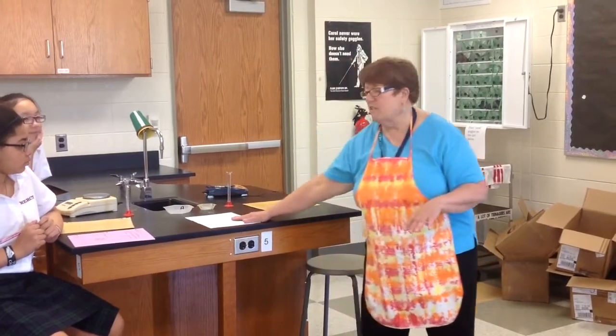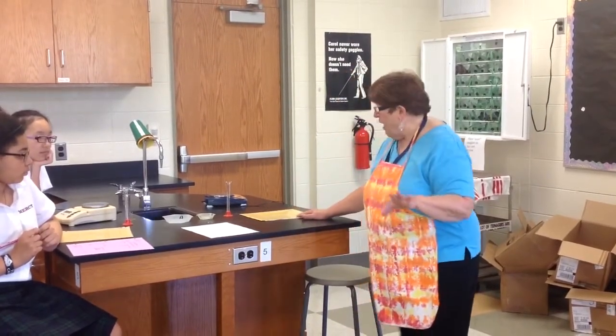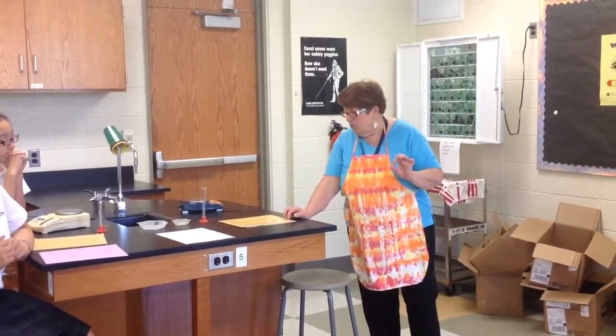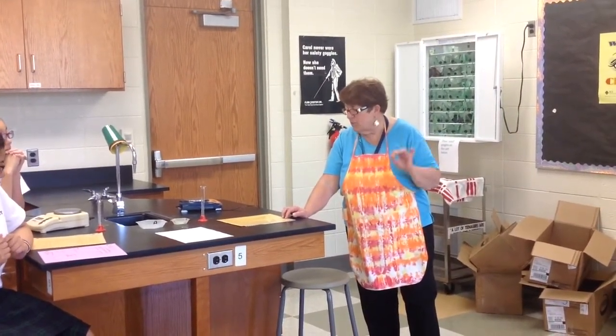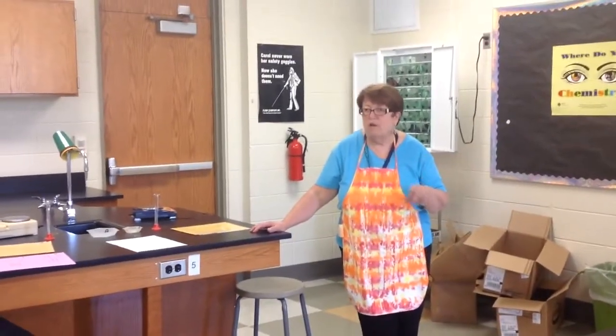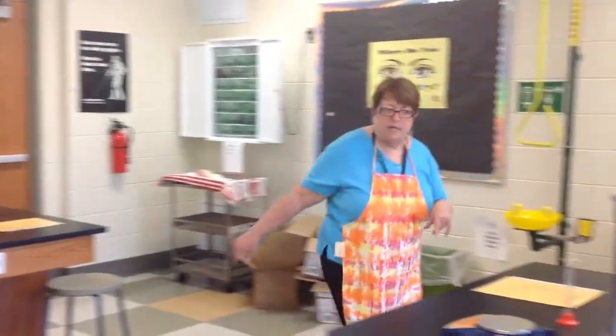Before you leave this station, you should write down the mass and the volume of the metal on this sheet. I will make a graph later, and then one of the questions, number 31, says once the graphs have been completed, what do they show? So I will talk about that with you probably Wednesday.